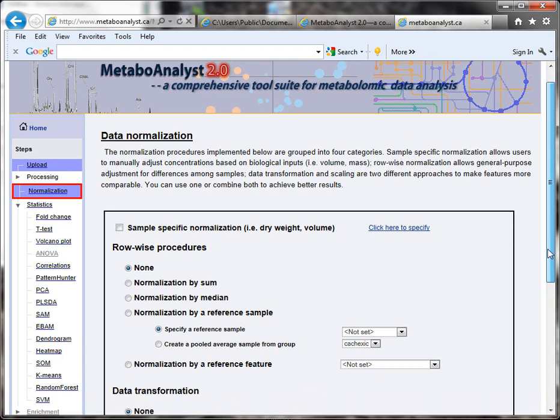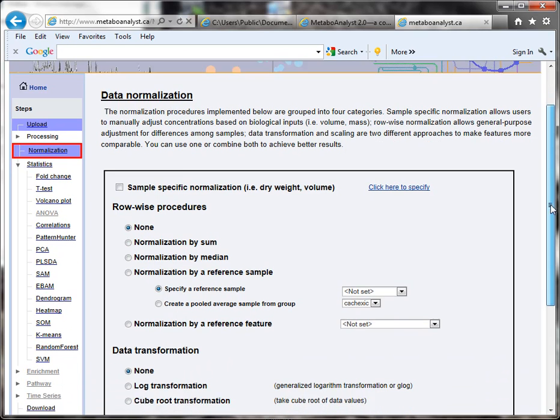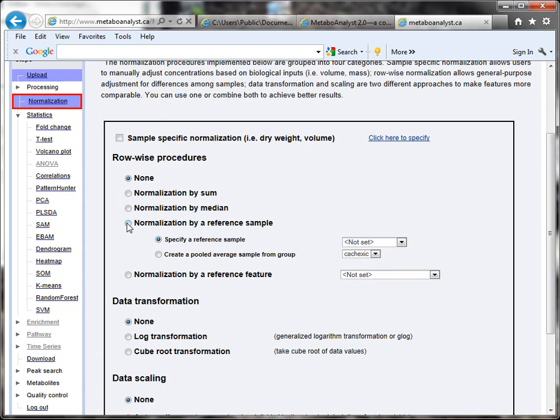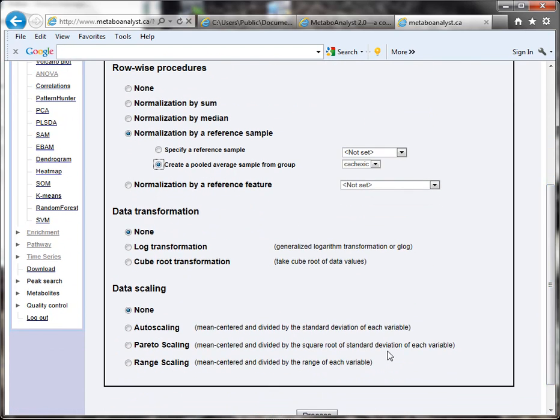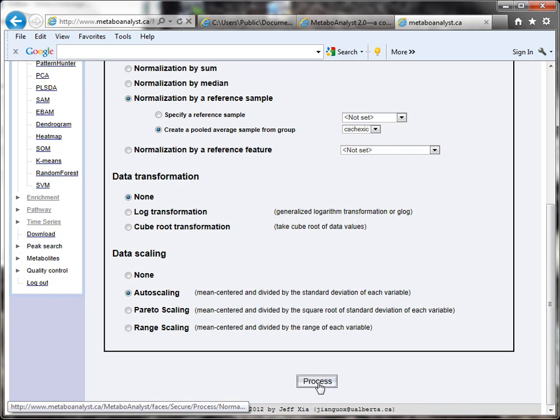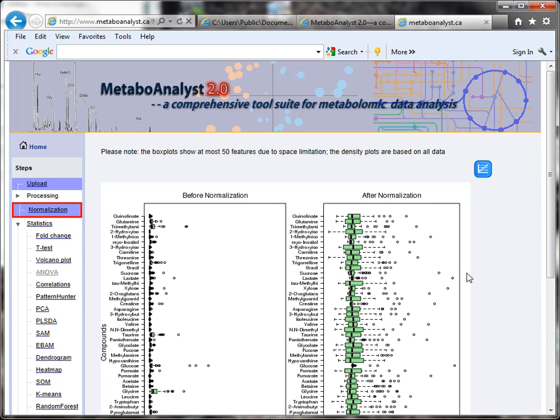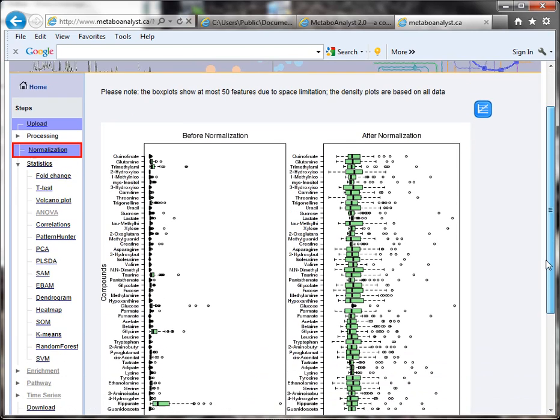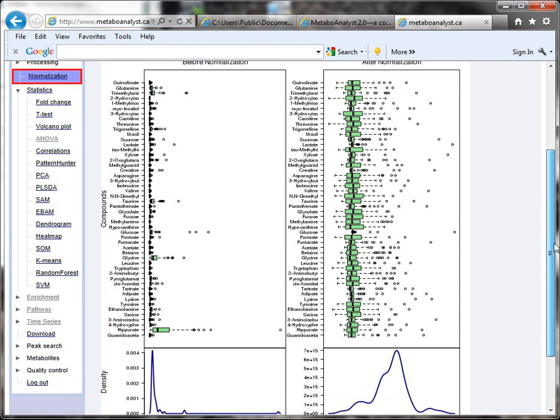Next you can normalize your data. For this step, I'm going to click Normalize by a reference sample, create a pooled average sample from the group, and then I'm going to click Auto Scaling. I got these settings actually from one of their tutorials. So I'll click Process. Very quickly what I get are two graphs—this shows my data before normalization, and this shows it after.